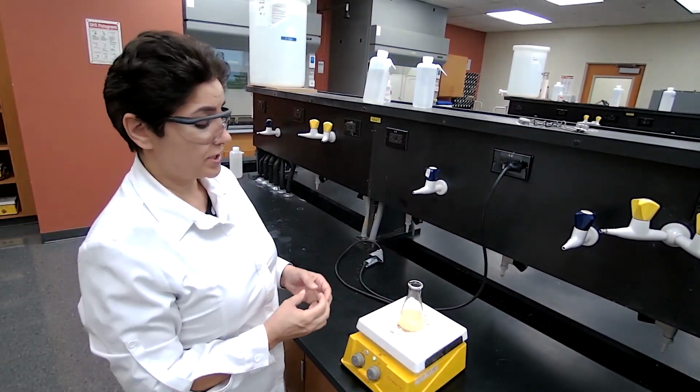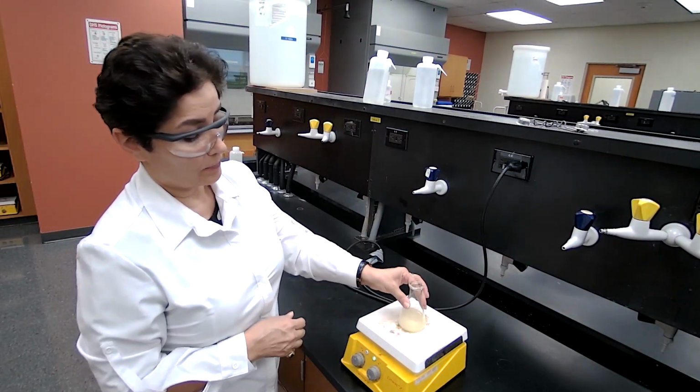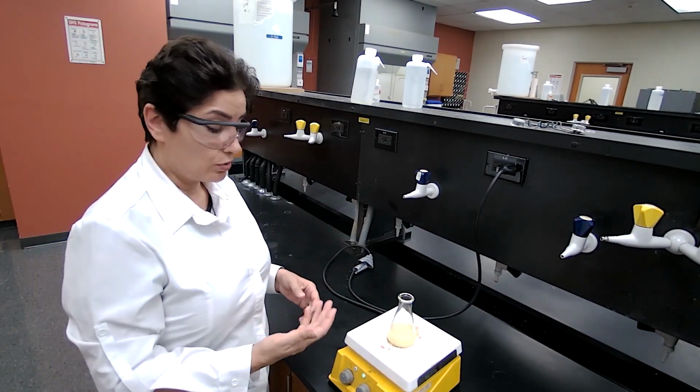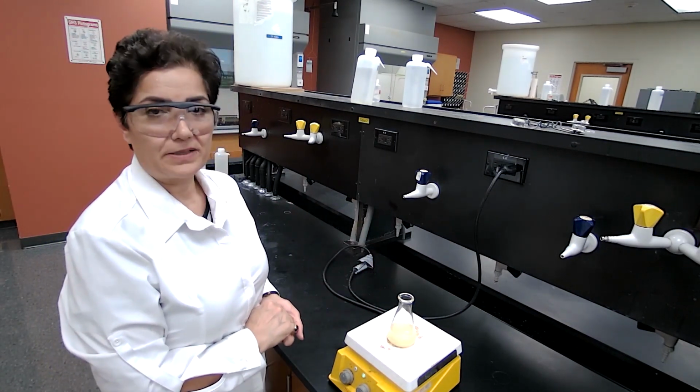I see the color change, I see the precipitation, it turned cloudy already, and our product actually is a solid compound. So we're going to pause the recording at this point and come back after the 30 minutes.